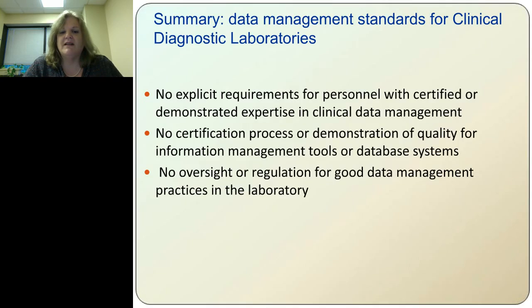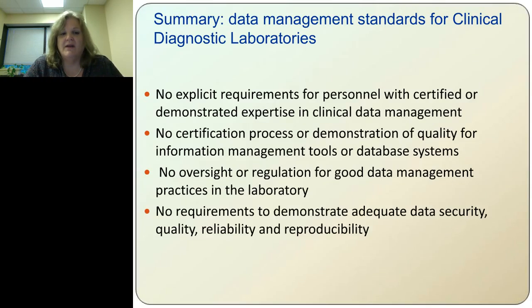And there's no oversight or regulation for good data management practices in the laboratory outside of some of the stipulations in the LIMS system that New York uses. There are no stipulations for demonstrating data integrity month to month, or looking for correctly normalized database tables, or so that the data that you put in last year is still the data you have today. There's no checks on that. And there's no requirements to demonstrate adequate data security, quality, reliability, and reproducibility.